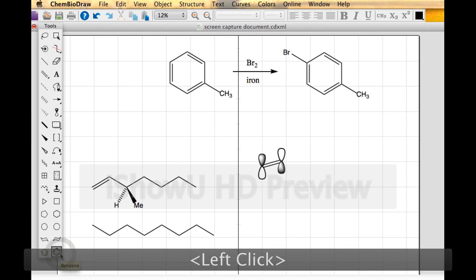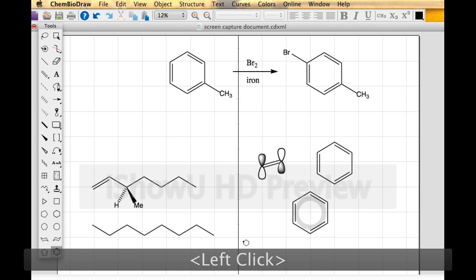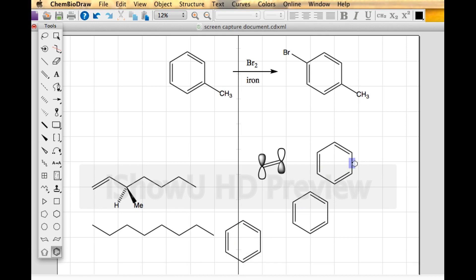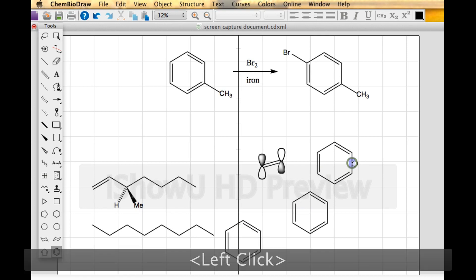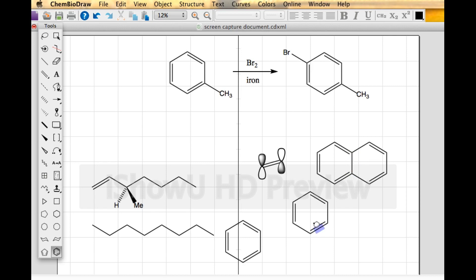I drew benzene earlier, but I'd never draw it again that way. Every time I click with the benzene tool, I get a benzene. Also, if I click with the benzene tool on a bond, now I have a fused ring like naphthalene. You can see there are lots of other types of rings you can make.